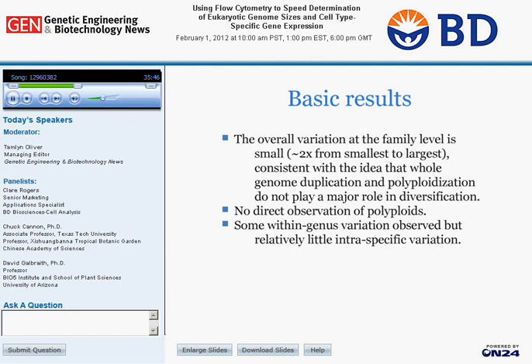That then leads us to better questions. We didn't know anything about genome size before, and now we can begin to ask more detailed questions about what really is going on within the genus, and what these slight differences in genome size are doing to the genetic diversity or the phenotypic diversity in that species.